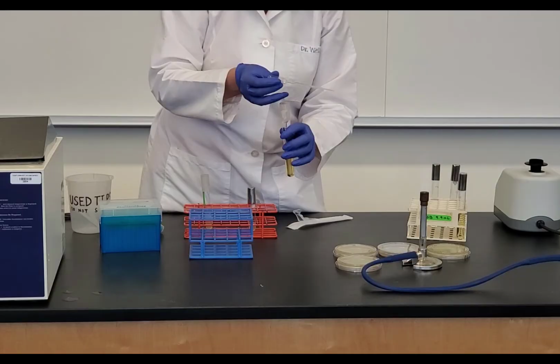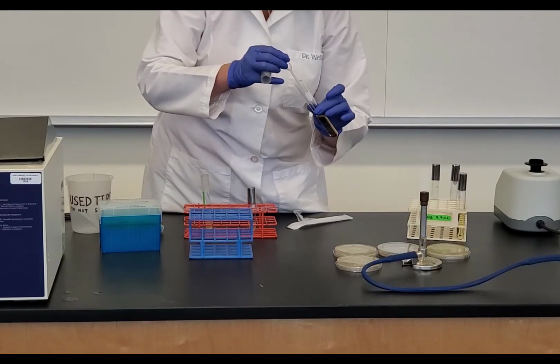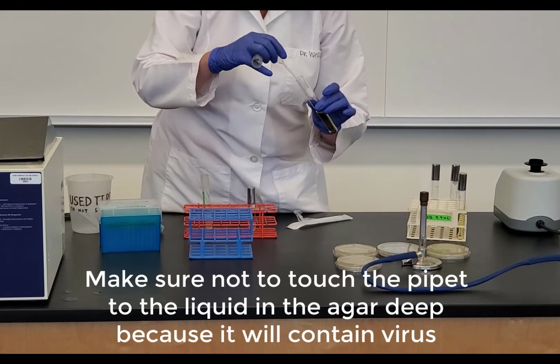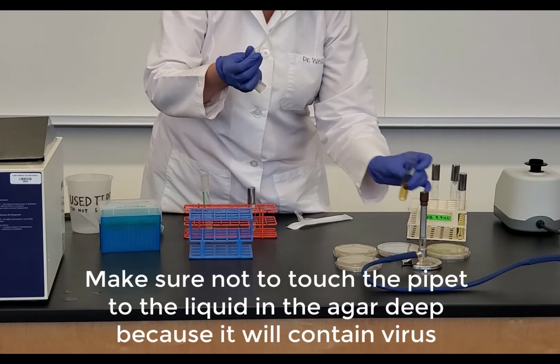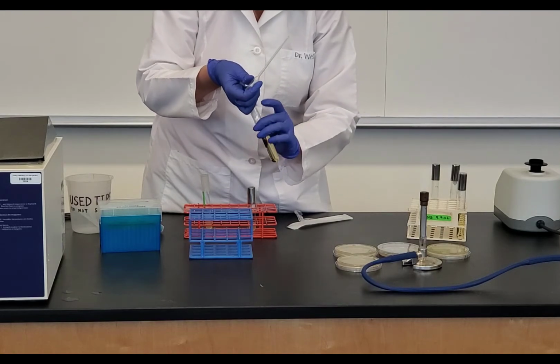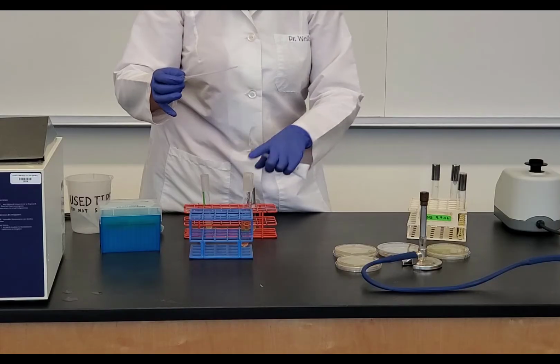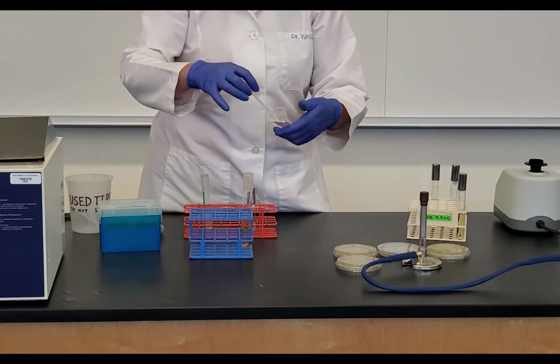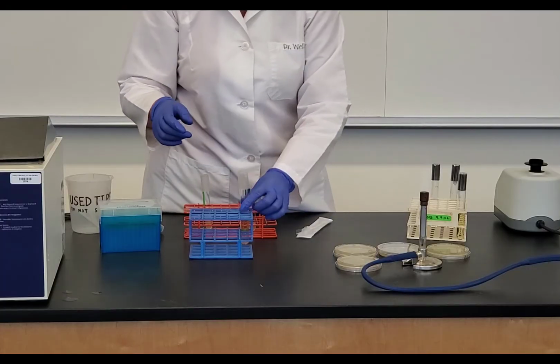Now I'm going to add it to my melted agar deep. So flame it, add. Dispense all the way. Flame it, cap it. I have to work quickly at this point so this doesn't solidify before I pour it. I'm going to put my transfer pipette back in the wrapper until I'm ready to use it again.